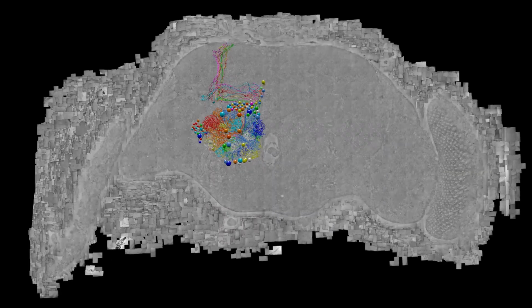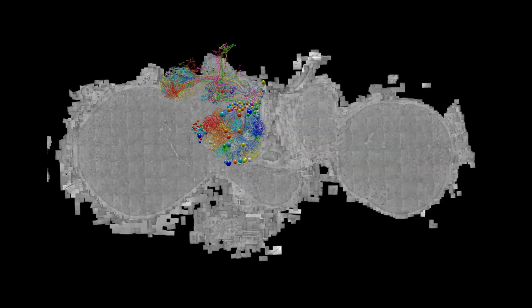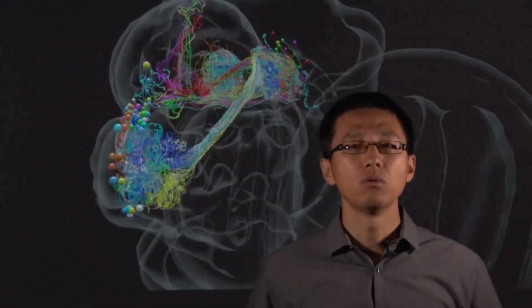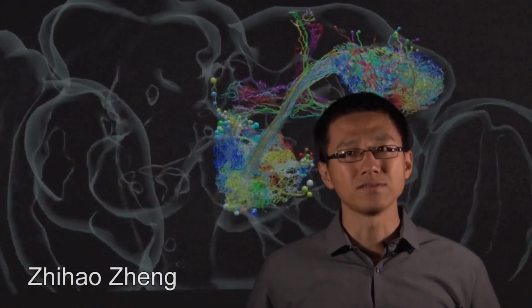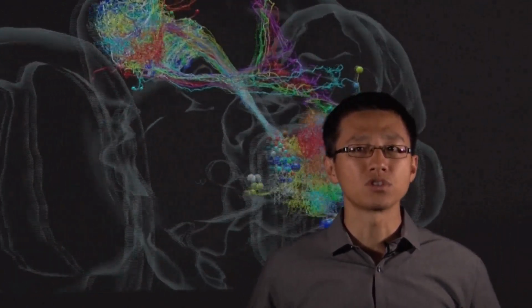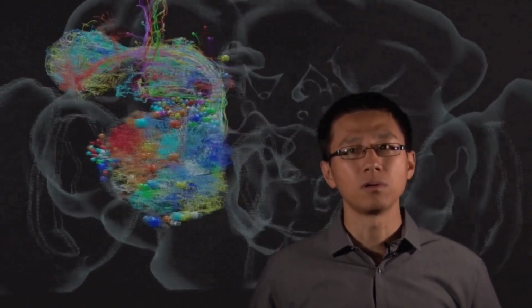We focused our efforts on the fly's olfactory system because the anatomy of olfactory neurons has been very well characterized at the light level. This meant we knew what to expect when reconstructing these neurons using the electron microscopy data set. We reconstructed all the olfactory neurons providing input to the mushroom body, a part of the fly brain used for associated memory formation and recall.